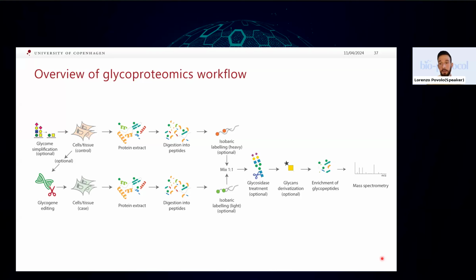Of course, other steps are important as well. A good trypsin digestion is required to have peptides and not intact proteins, although the other steps are relatively more robust. Another important step is how you search your mass spectrometry data. Here we could do a whole new webinar on this.